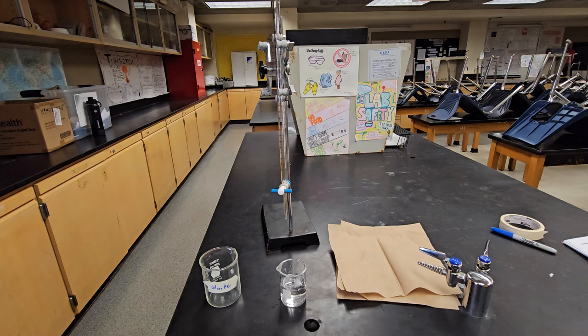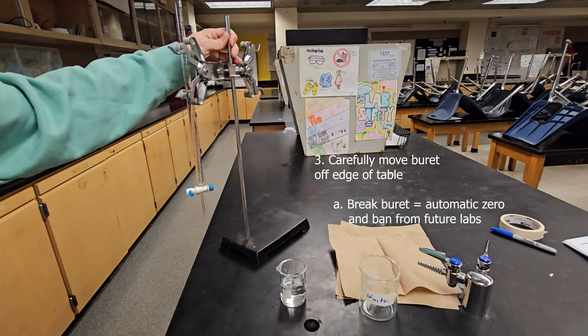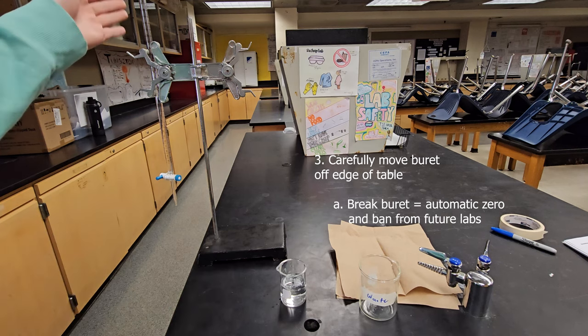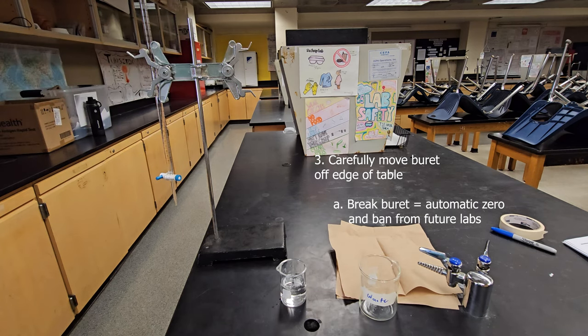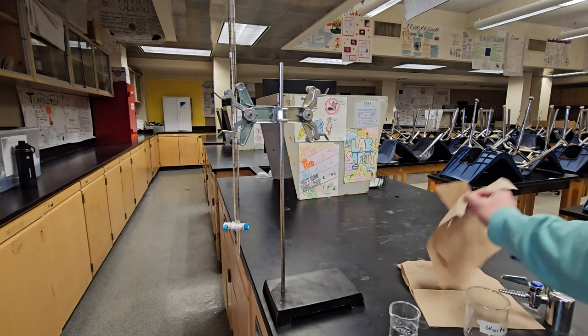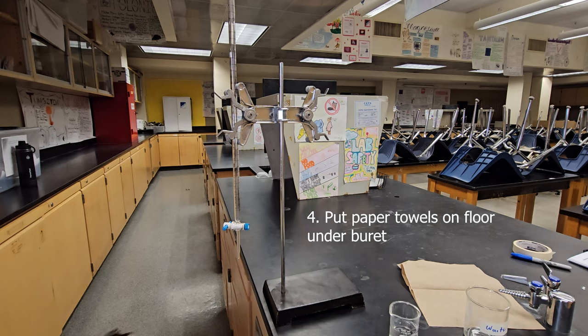Once your burette is closed and you've got your water, you're going to fill up the burette. First, very carefully move the burette off the edge of the table so the stand is on the table and the burette hangs off the side. Be very careful that the burette does not tip over — if you break it, you'll get an automatic zero and be banned from future labs. Get a couple of paper towels and place them on the floor underneath the burette, so that if it spills, the water falls on the towels and is easier to clean up.